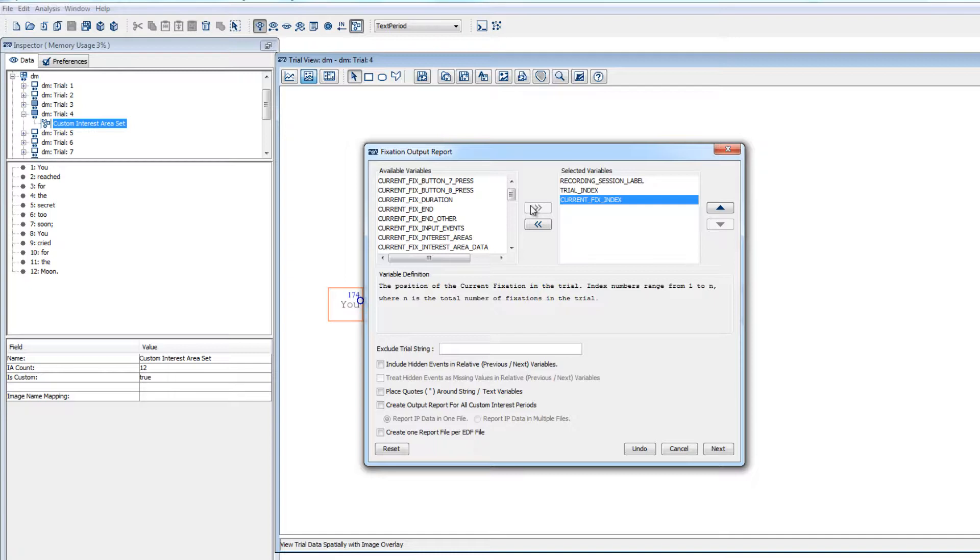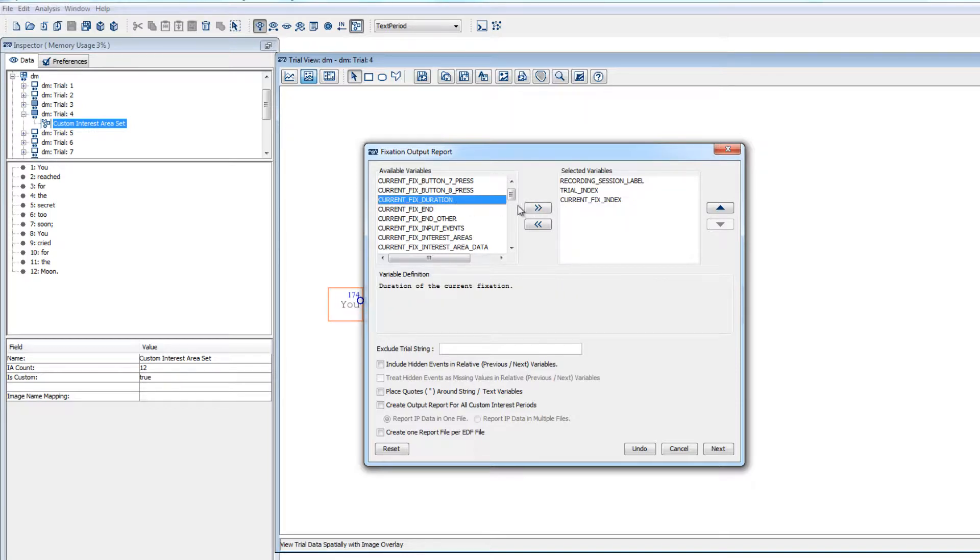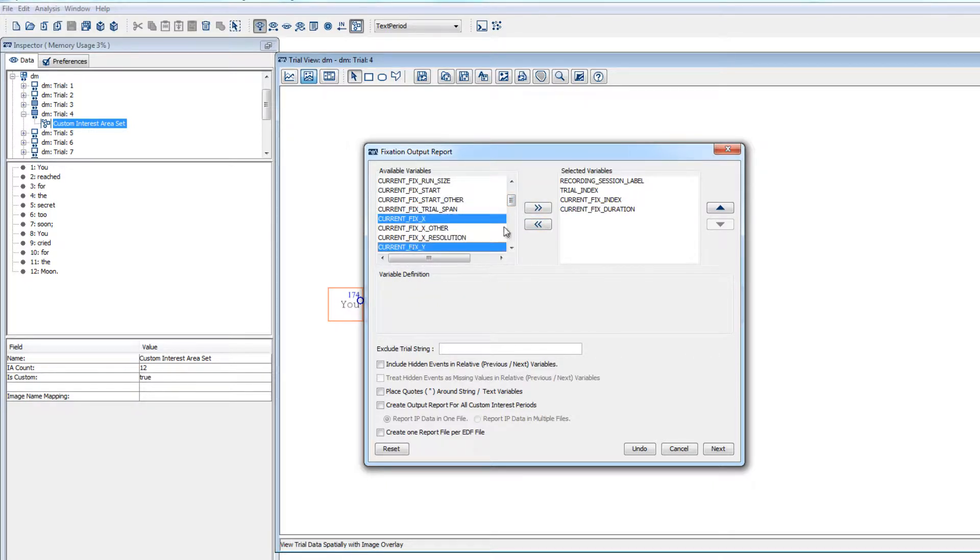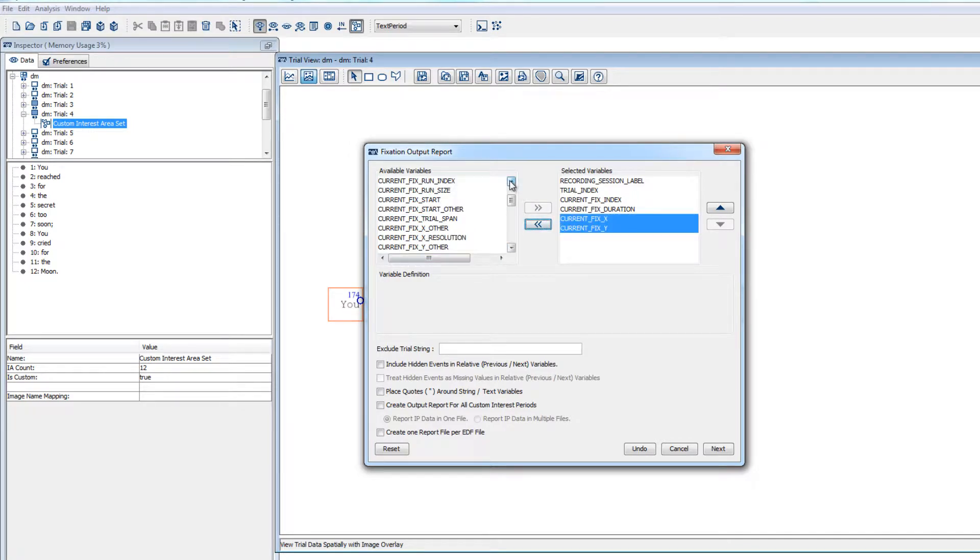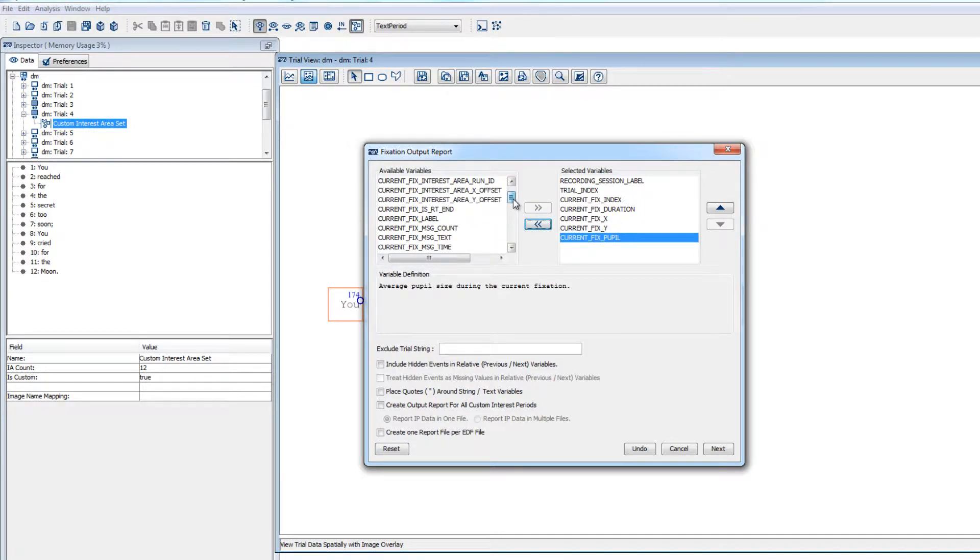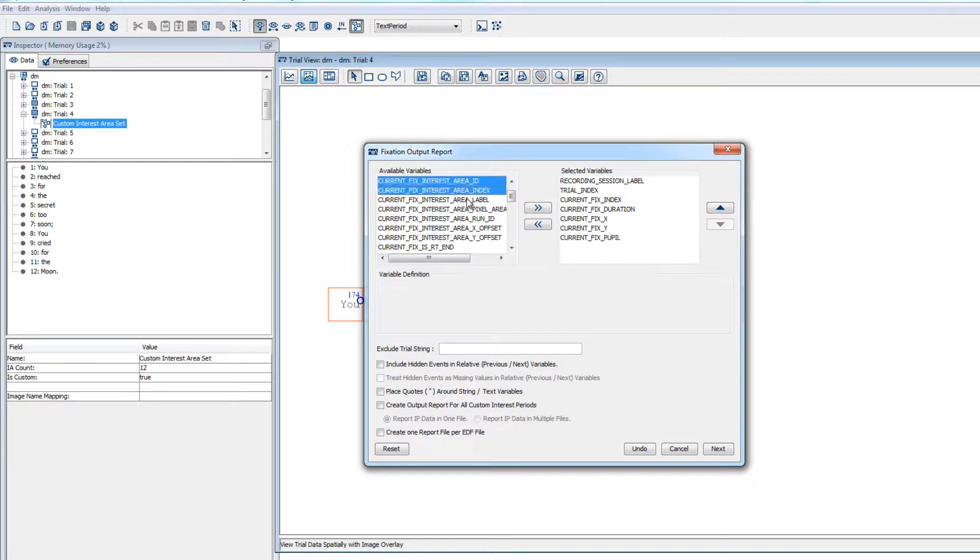We might also want to include current fix duration, which is the duration of the fixation, and current fix x and current fix y, which are the x and y coordinates of the fixation respectively. We could also include the size of the pupil and information about which interest area the fixation was in. Note, these interest area variables will have missing values if the fixation was not in any interest area.